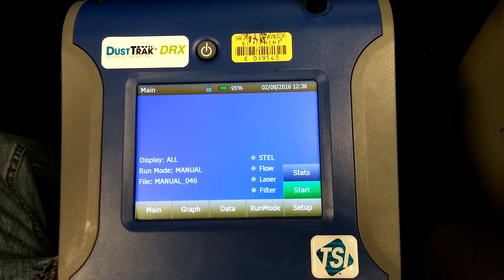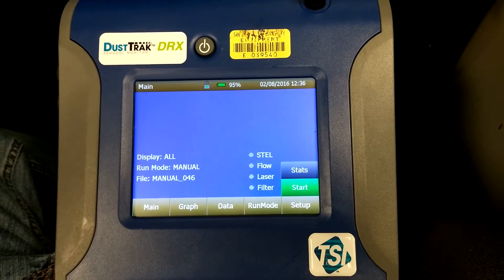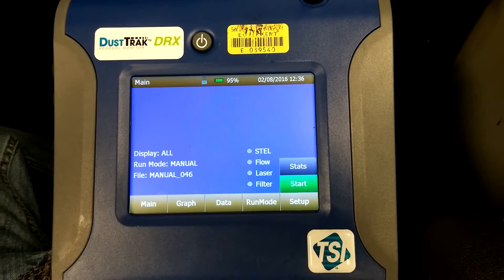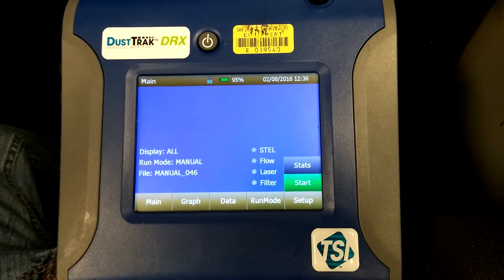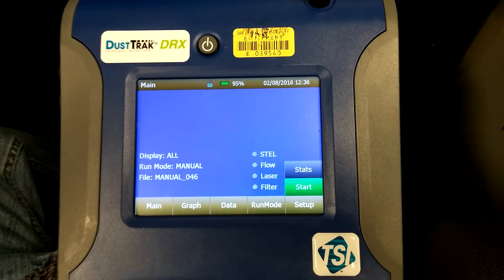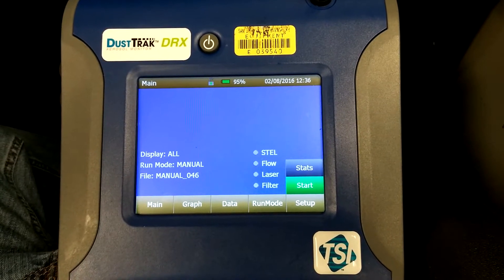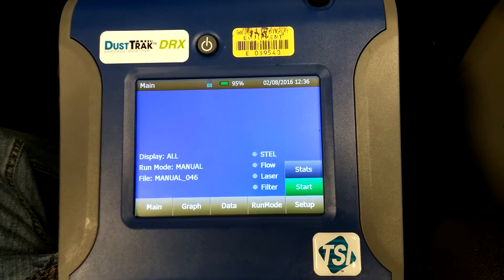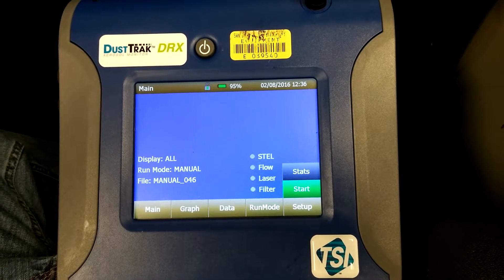So it's always important to check the time before every sampling session to make sure that not only will your instrument be synced up properly with the data from other devices, but so that it'll be synced up properly in your log, and so that you'll know what really is occurring out there.